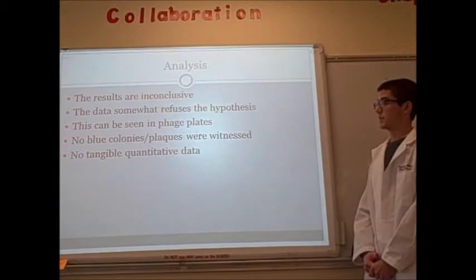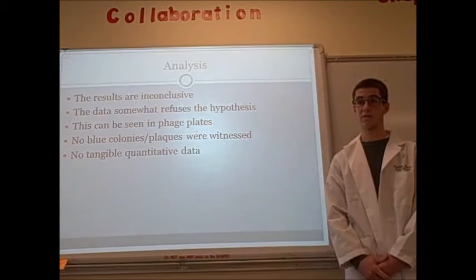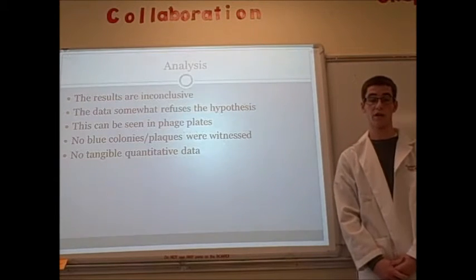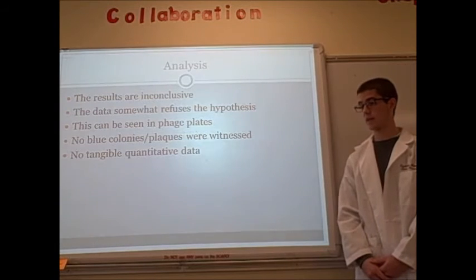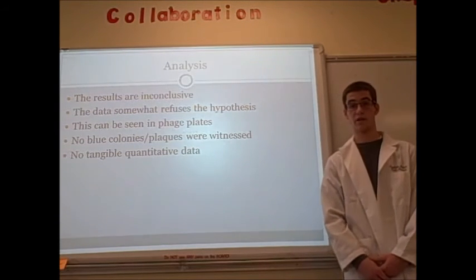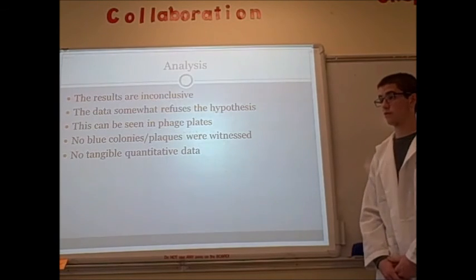This, however, can't be conclusive because I could not compare with my pUC19 plate, which had colonies as well, but no blue colonies. So in the end, there was no tangible quantitative data from my experiment, but it did somewhat refute my hypothesis.